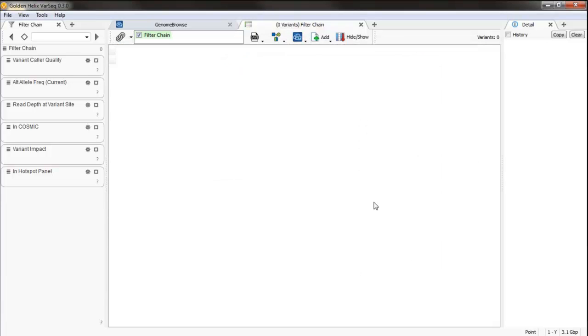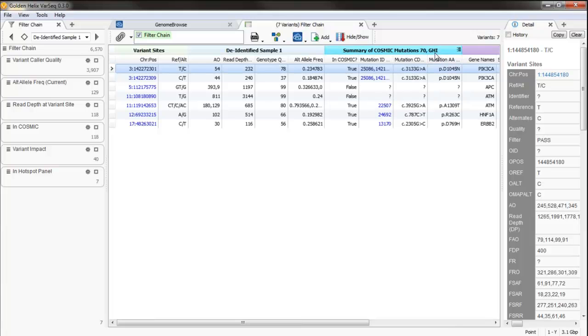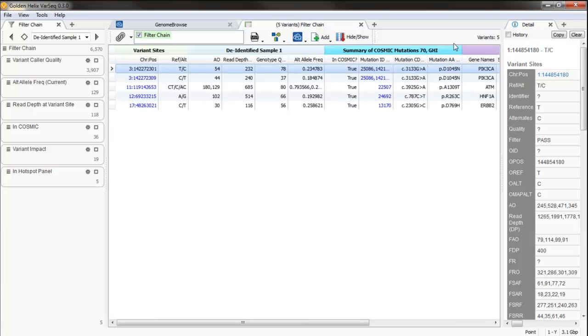This is going to happen very quick, so I have to explain quickly what's happening. Immediately what I'm doing is processing that data. I have 6,000 variants across those four samples already imported. A couple annotation sources are being filled in the background asynchronously as we go. And this filtering process is updating to include all of those. So here is my filter chain.